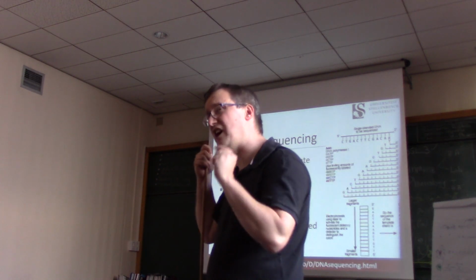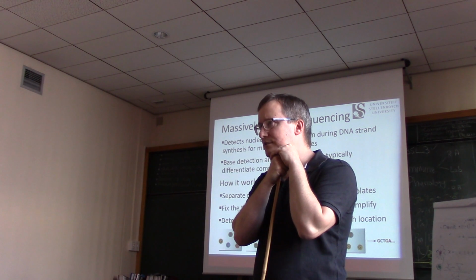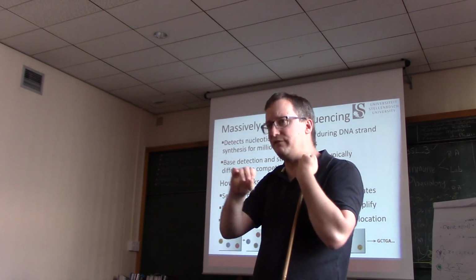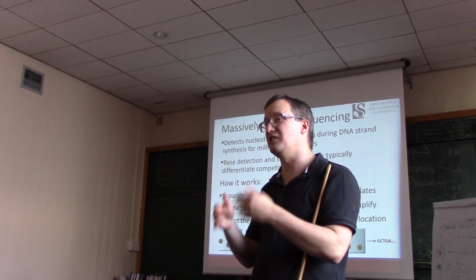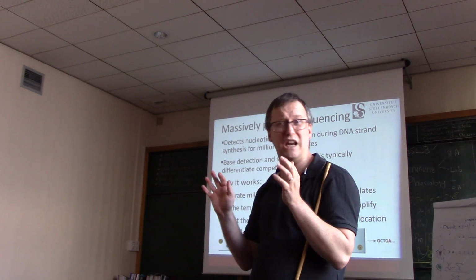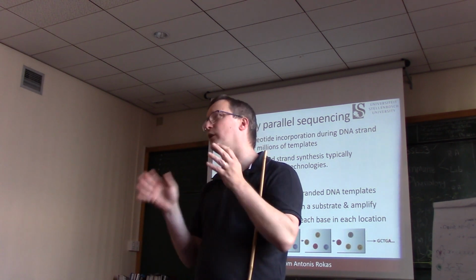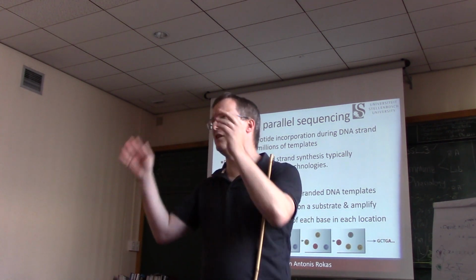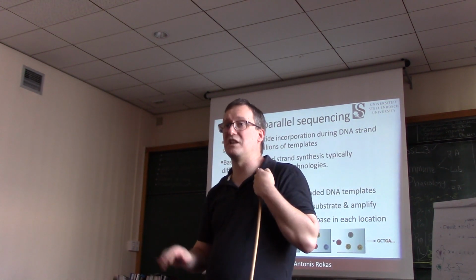Now, I want to stress that this is not how we typically do sequencing today. So, among other reasons, if you have to work from a purified template like this, the number of different sequences that you can produce complementary sequences for in one go is limited to the number of separations that you can do in your instrument. And that's typically limited to about 384 for like the deluxe model, right? And in the old days, having 24 capillaries was pretty big. But in the days of the genome sequencing project, having, say, 384 different capillaries was possible. But that is not what we do these days when we send things out for sequencing.